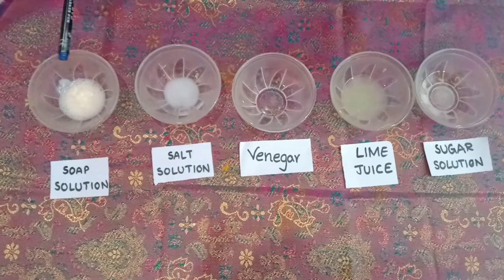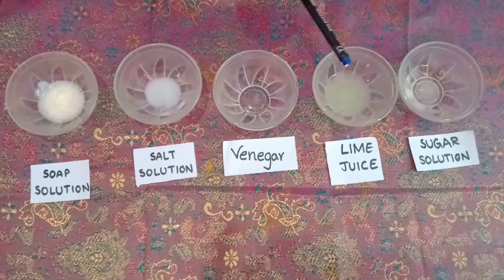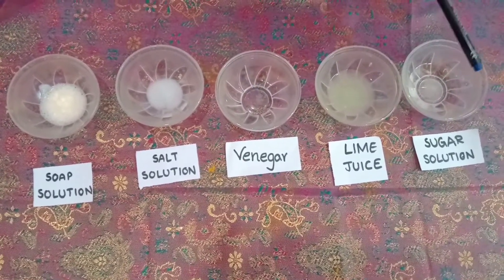Here I am taking soap solution, salt solution, vinegar, lime juice, and sugar solution.